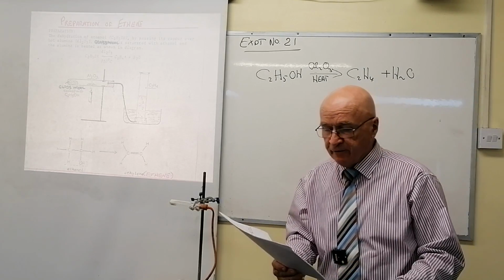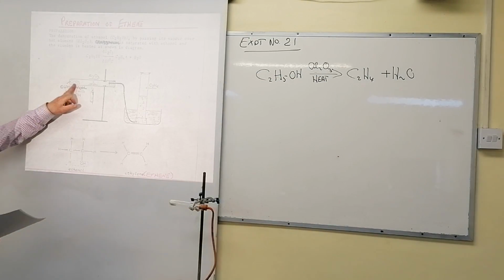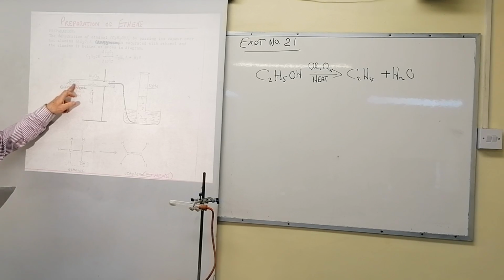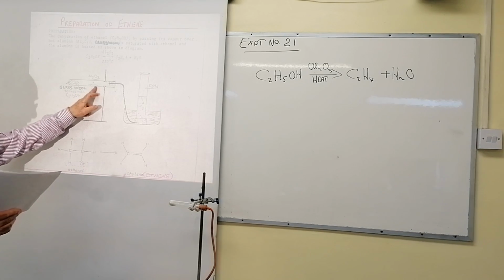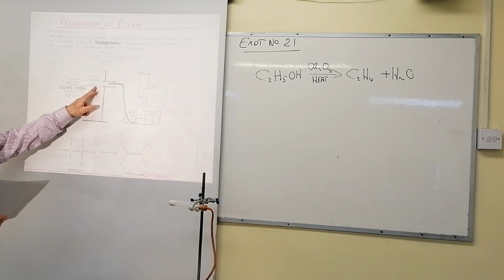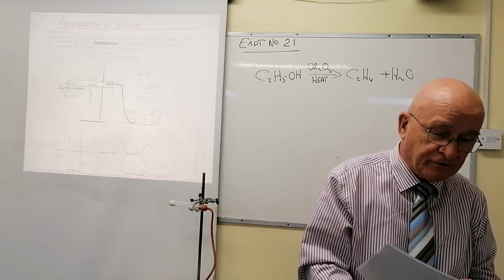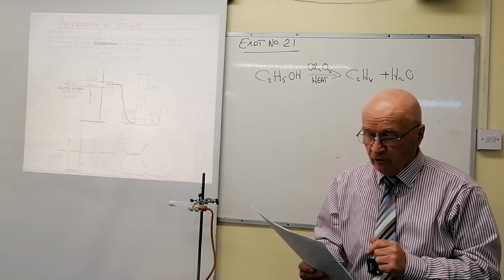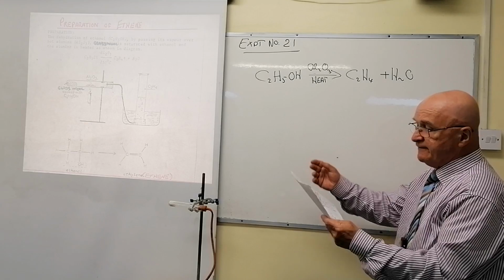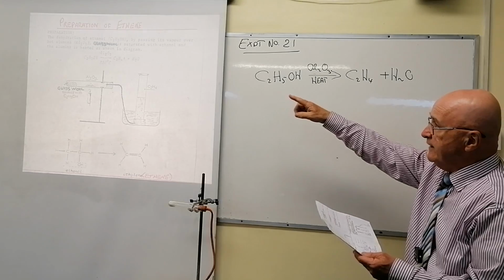That's very important. So into your notes now, you have to label the parts A, B and C. A is glass wool soaked in ethanol. That's into your notes now, there's a space there for A. B is a little heap of solid there, and that is aluminium oxide powder. And C is the product gas, that's ethene gas being collected over water. Fill them in, please, in the gaps in the notes. It's very important that you have them. And I'm stressing again to you now, there is an expectation that you could write that full equation. Aluminium oxide goes in last.